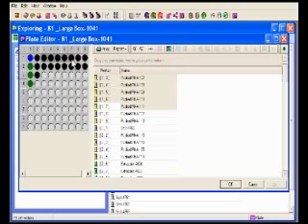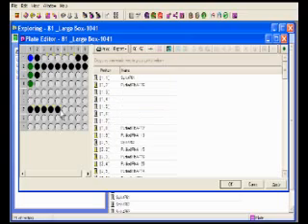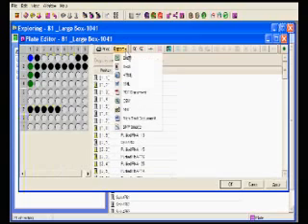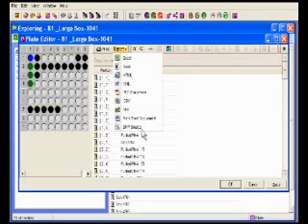Then move items in and out of multiple well positions, from within a plate or between plates. In addition to significantly increasing laboratory throughput with plate automation, users can easily print or export their work, so data can be shared and manipulated outside of Nautilus.